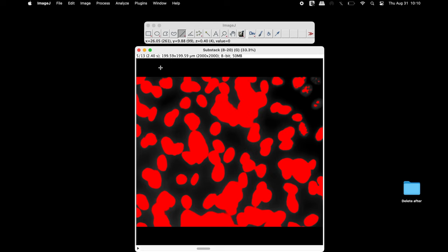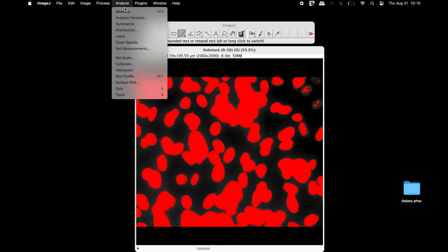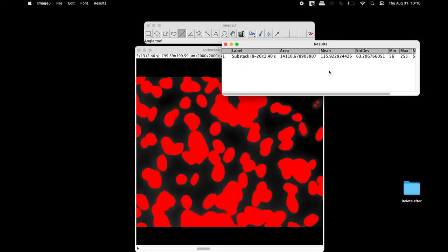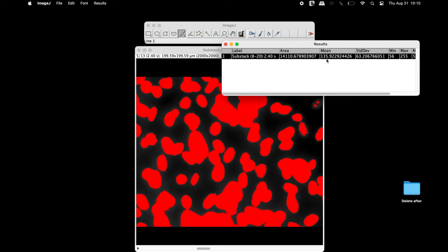To measure the area and mean intensity of only one slice, click Analyze and Measure. The area and mean intensity is displayed in the results window.